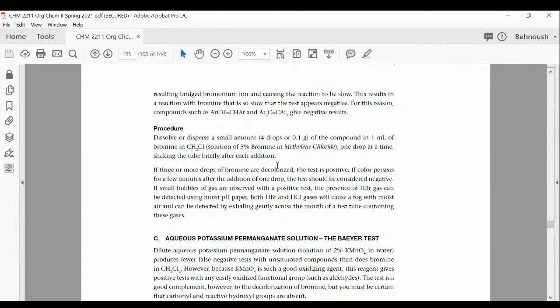So you can keep it the same way in your lab notebook or organize it any way that makes more sense to you. But since there were too many reactions, I couldn't put all the theories in one place and then go to the procedure, because then you have to go back like 3 pages back in order to see what it's talking about. So this way it makes more sense in terms of understanding why this reaction is behaving this way or not.